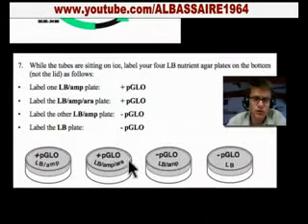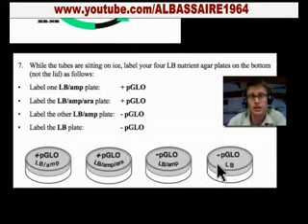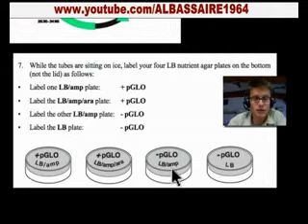Here we have 4 different plates, and so we're going to take regular bacteria, and in 2 of those plates, we're going to actually add the plasmid, and in 2 of the plates, we're not going to add it. And so we've got plus pGlow and then minus pGlow. In these, we're also going to have lauria broth and ampicillin. And so lauria broth, in this one right here, we should see bacteria growing. In this one, since there's ampicillin, we're not going to see bacteria grow unless they pick up that BLA. Which they won't if they don't have the plasmid.